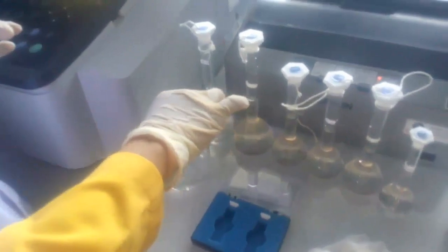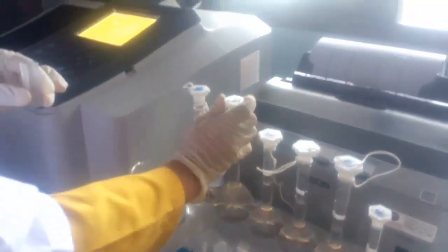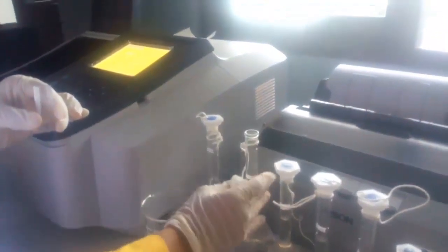Replace the blank cuvette in the measure slot with the 8 ppm standard of chloramphenicol. Pour out the blank. This is the 8 ppm standard of chloramphenicol.